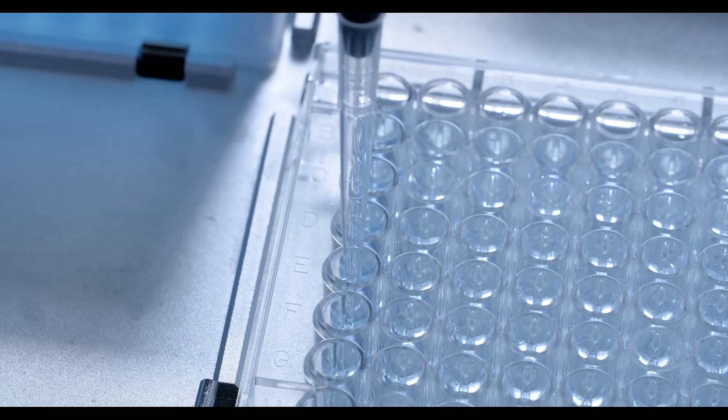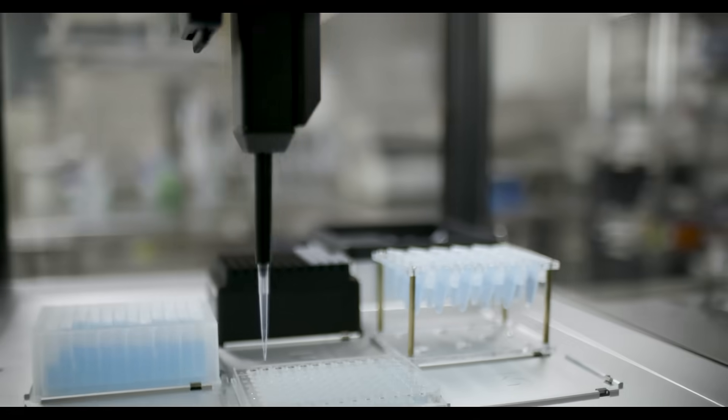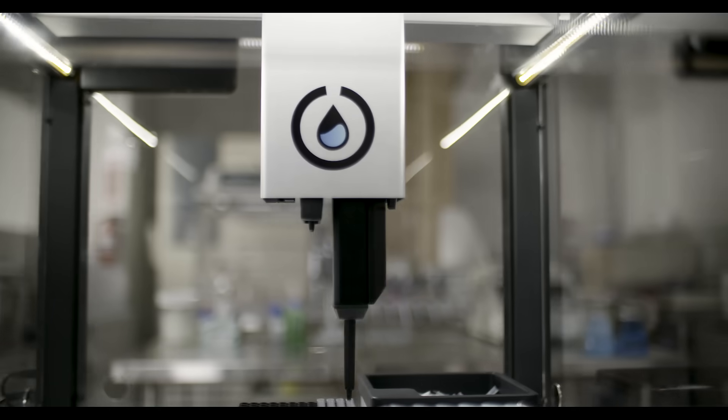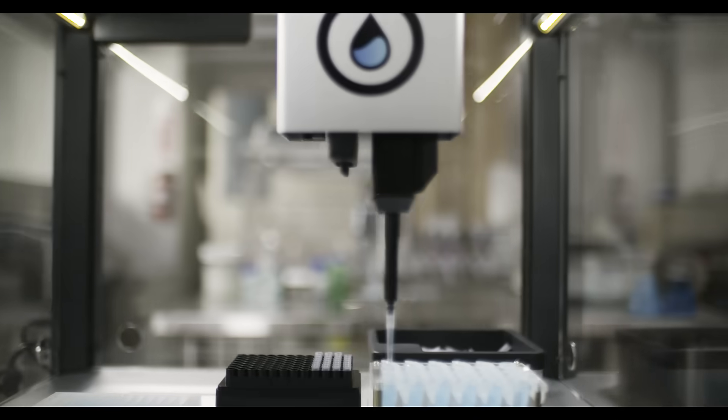that meet or exceed the accuracy and precision of other lab robots. Using high-performance parts and cutting-edge mechanical design techniques, the OT2 is faster than many robots ten times more expensive.